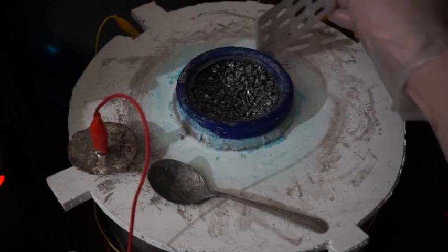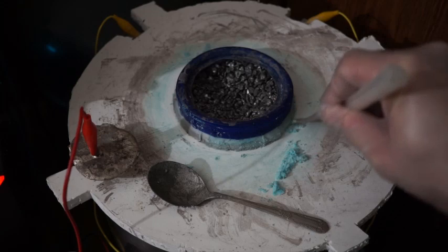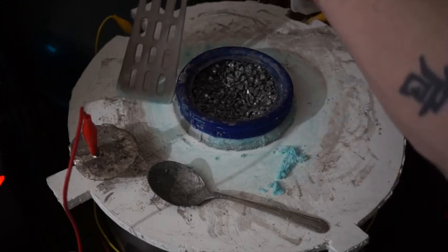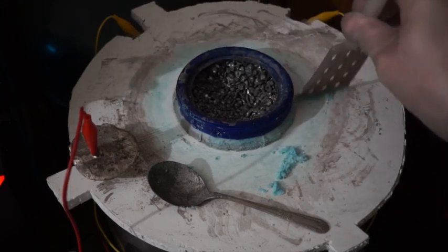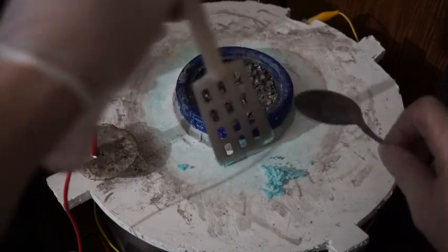Let's start by cleaning up any silver nitrate crystals. The silver nitrate crystals have a bluish tinge because they are contaminated with copper nitrate. Pure silver nitrate crystals normally appear white.